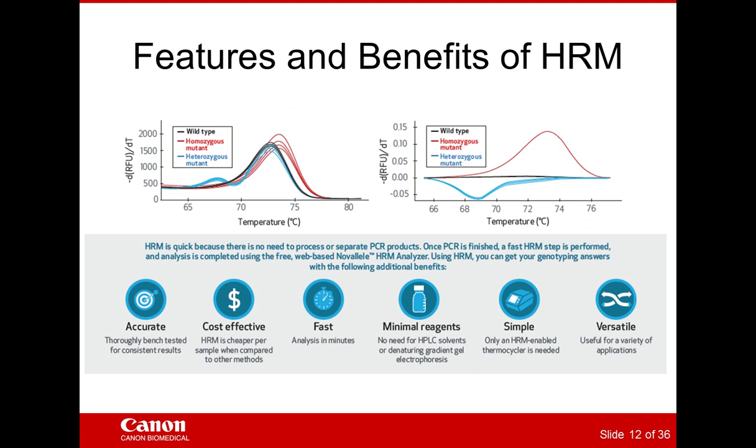So in that one, you have 2 species that exist. So not only will you see a temperature shift, but you also see 2 different melt domains. And that's why, in this example, you see 2 different melt transitions in the blue curve.